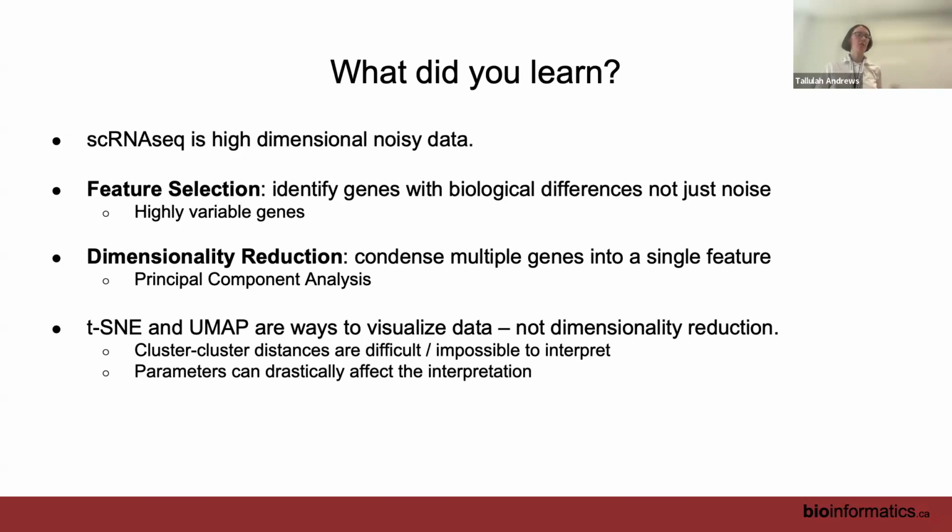There were a lot of reproducibility issues with t-SNE originally, but they all stemmed from the first version of t-SNE. The way t-SNE and UMAP both work is they first make a rough guess of where your dots should be in two-dimensional space, and then they iteratively improve on that guess.